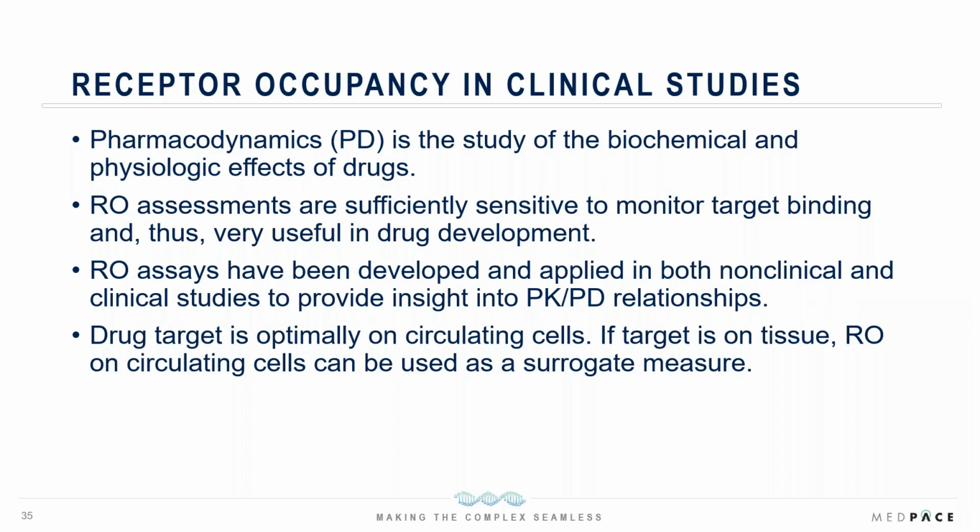Pharmacodynamics is the study of the biochemical and physiological effects of drugs. So receptor occupancy assessments, as Priscilla has shown, are sufficiently sensitive to monitor target binding and thus are very useful in drug development.